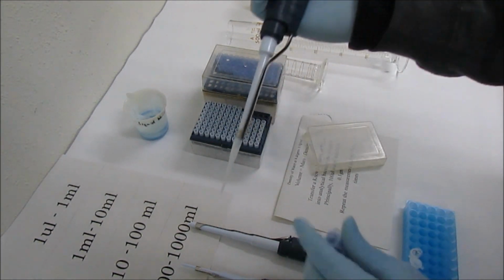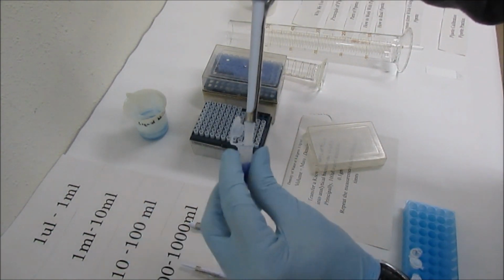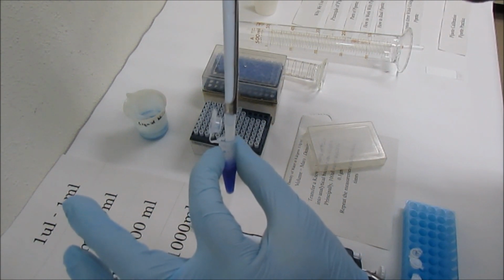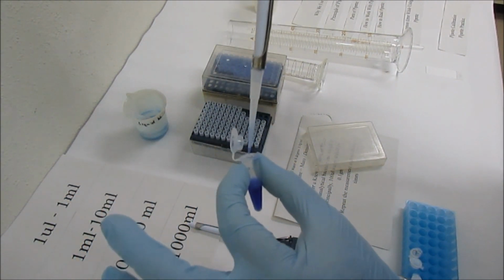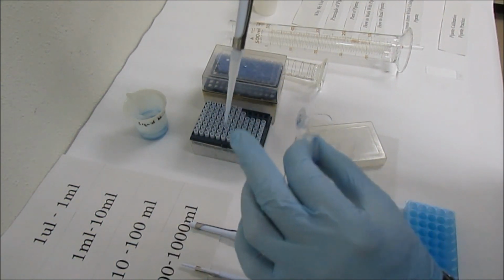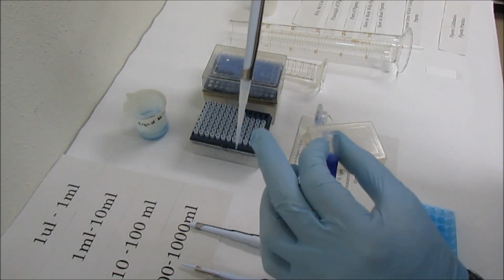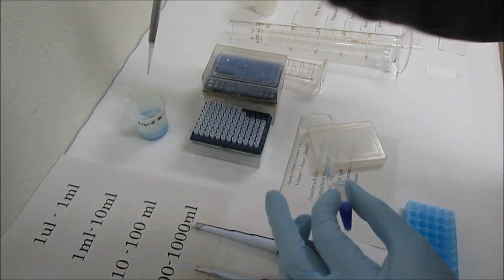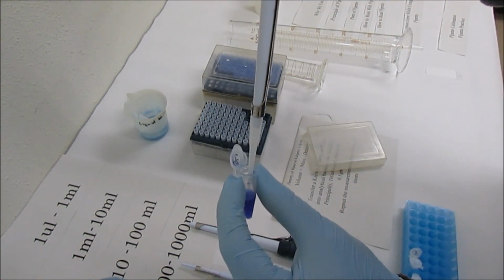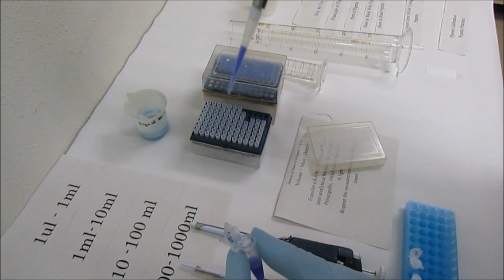So this is your tip. You never need to go to the bottom like this. You never need to go to the bottom of the tube, or touch the tip to the wall of the tube, because of capillary action, you will get more volume of liquid than the actual measurement, right? So I show you how you need to do it: just touch the liquid surface and aspirate.